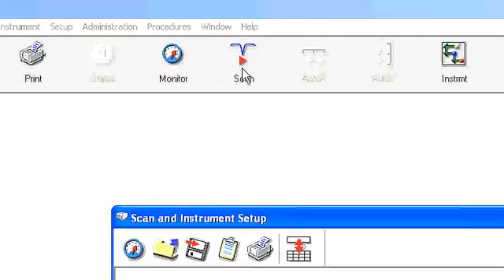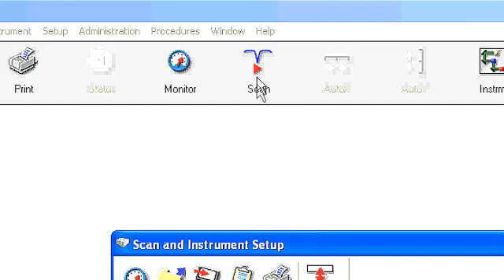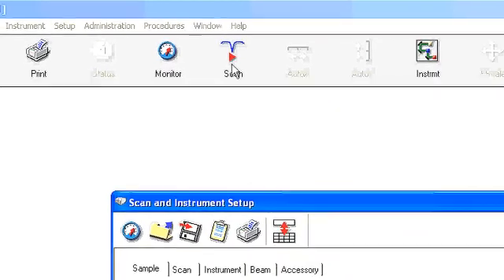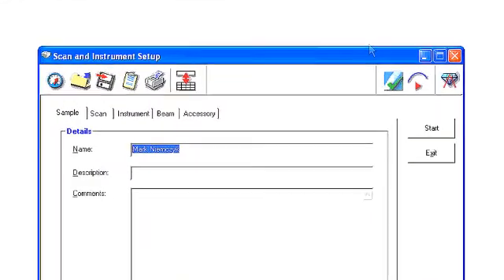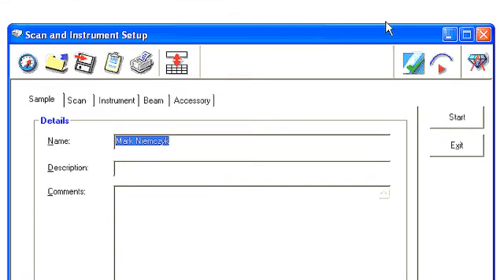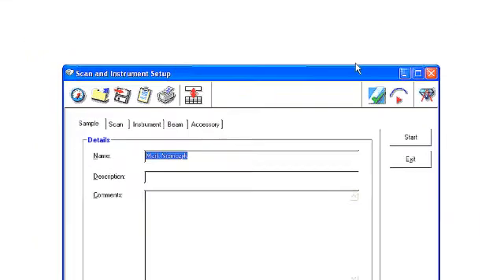The first thing we do is to click on the icon at the top of the screen, which is called Scan. Every IR spectrum that we take has to be preceded by what we call a background spectrum, and that can be found on the Scan and Instrument Setup panel here by clicking this particular icon. It always looks to me like an eye with an eyebrow over it.